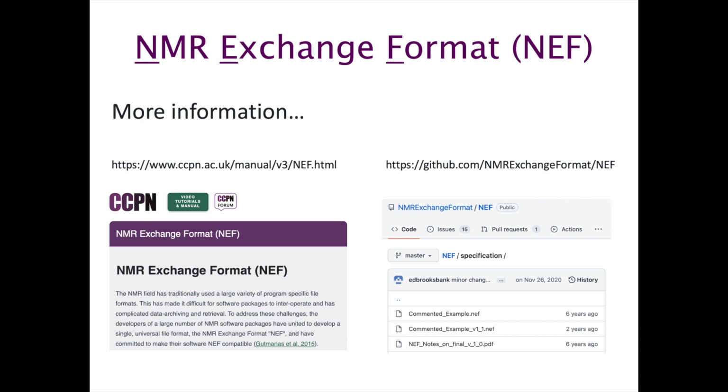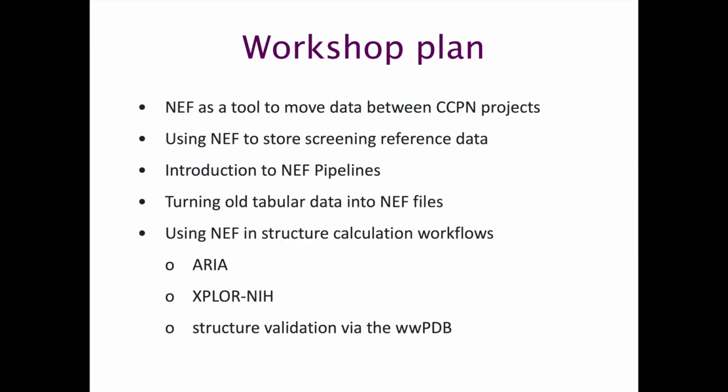So if you want some more information on the NMR Exchange format, then we've got a page here under our manual pages which explains some of what I've gone through just now. The more official page is this GitHub page, but it's probably slightly less user-friendly than what we've provided on our webpage. Here's a plan of what we're going to be doing in the workshop today.